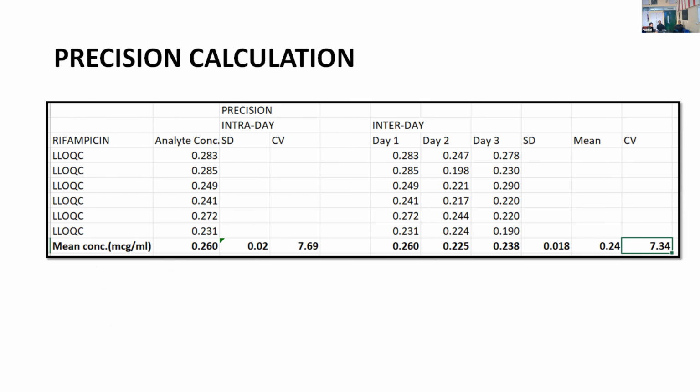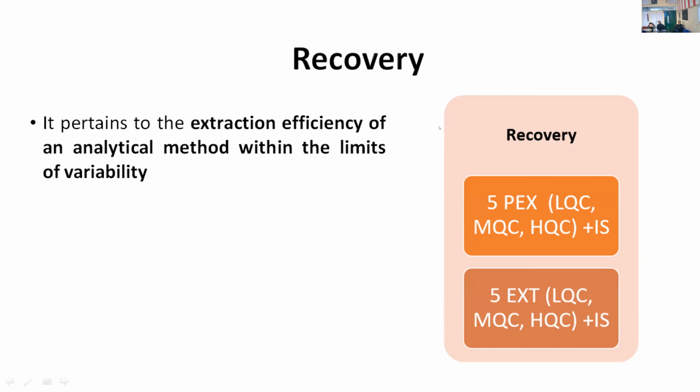Then, this is our precision calculation. Here we will just check the coefficient of variation for both the intraday and the interday. Now coming on to the third part of the validation parameters, that is the recovery.